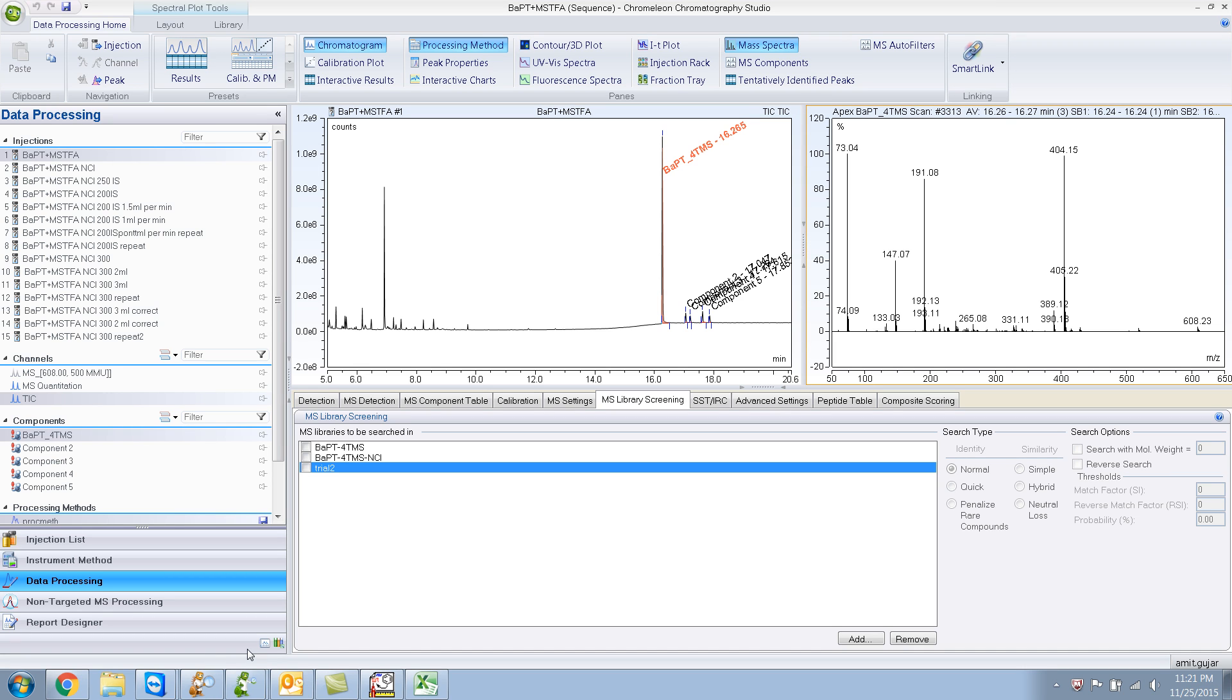Today I wanted to show you how to create your own custom library. For example, if you have a particular peak that is not present in the NIST library.